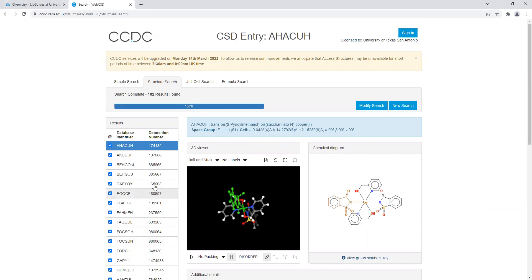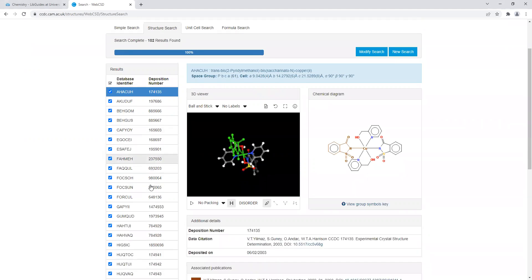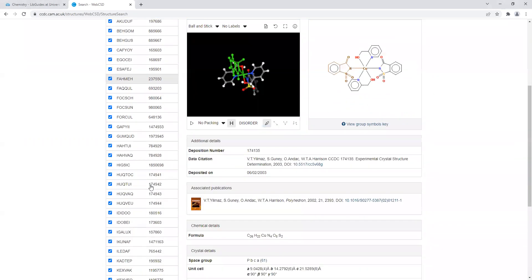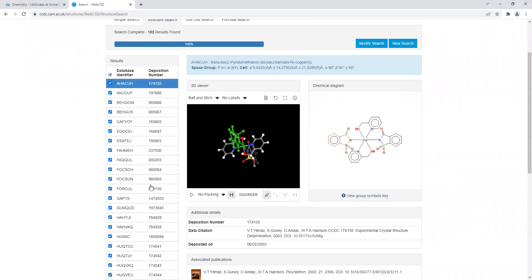And so we have a hit of 102 results. You just need to scroll through, find some structure you'd like that contain saccharinate and your metal. Make sure you're able to download the article, and that's the structure you can use to help write your lab report.